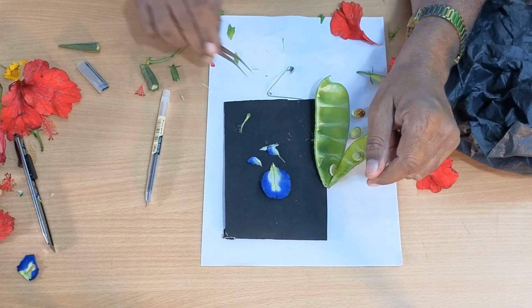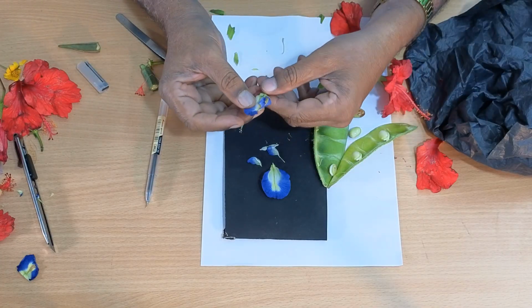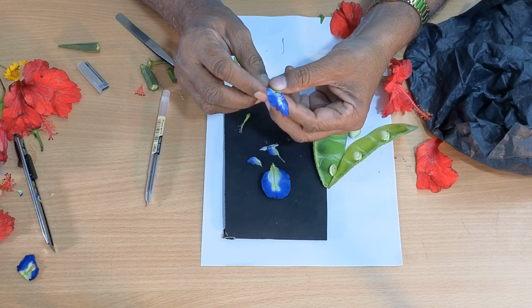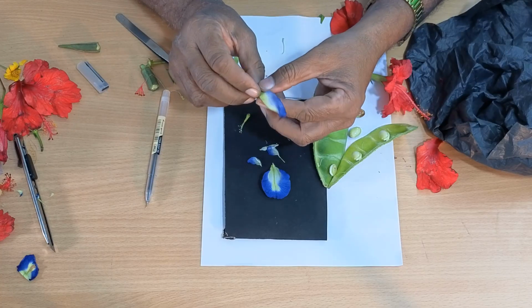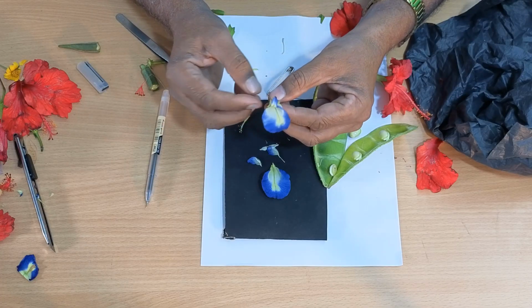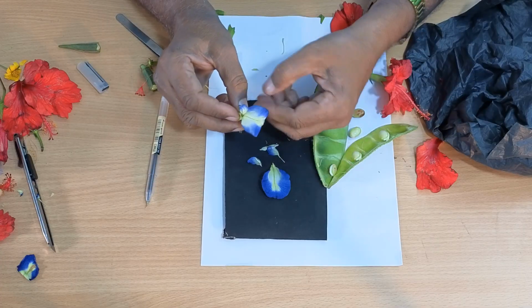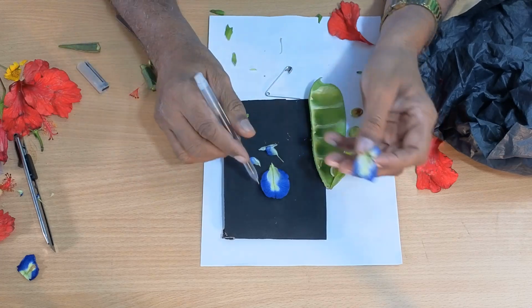Clitoria dissection. As you know, this flower is a bisexual flower and zygomorphic flower. You cannot cut into two equal halves passing through any given angle. This has what you call the pulvinus leaf base in the leaf. In the calyx, we find 5 sepals, gamosepalous, and this is valvate distribution. Corolla 5 petals, papilionaceous corolla, and we have different sized petals.